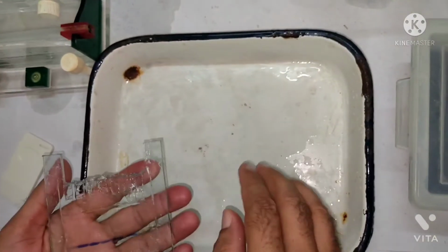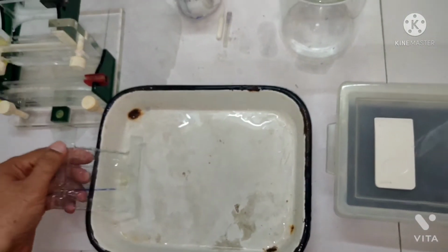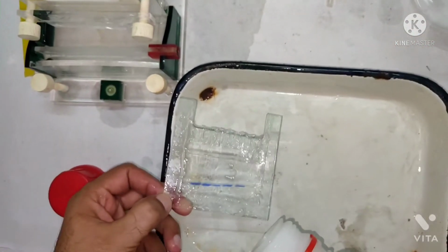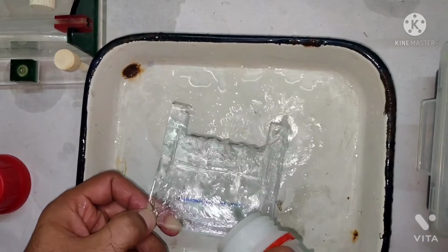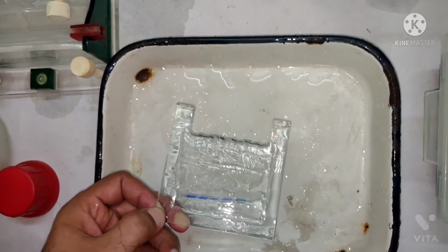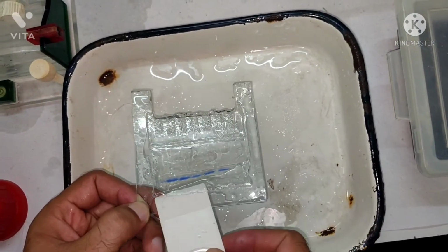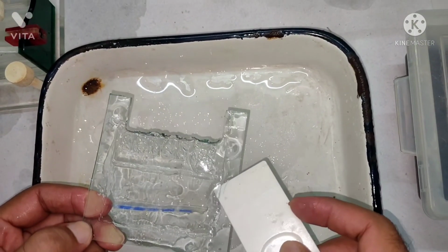Now you can see this tray is there, and you just put some distilled water, simply, or double distilled water, right? This is just the washing process, nothing more than that. So I washed it from the upper side, right? And now with the help of this spoon-like apparatus, you remove the gel very carefully so that it won't break.